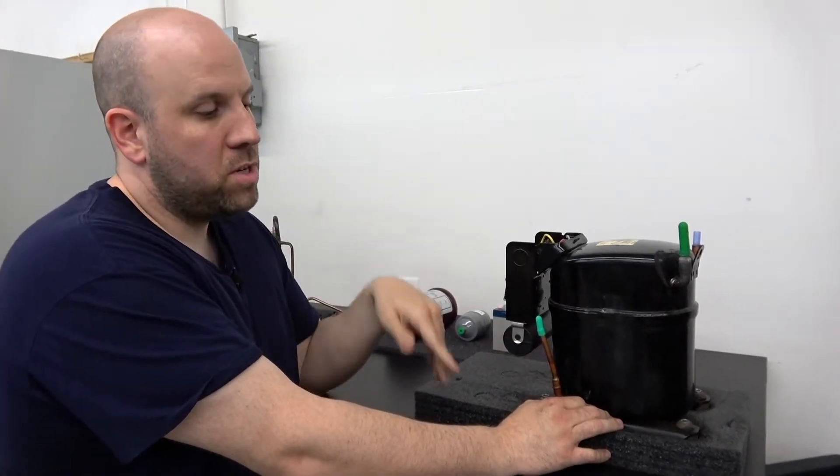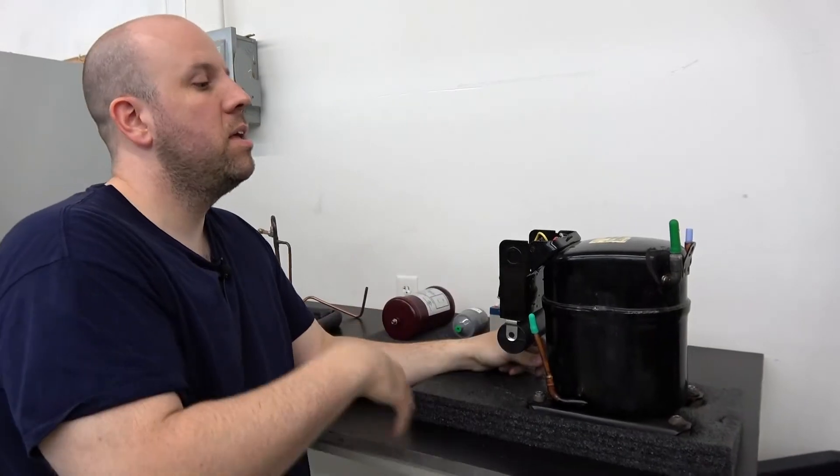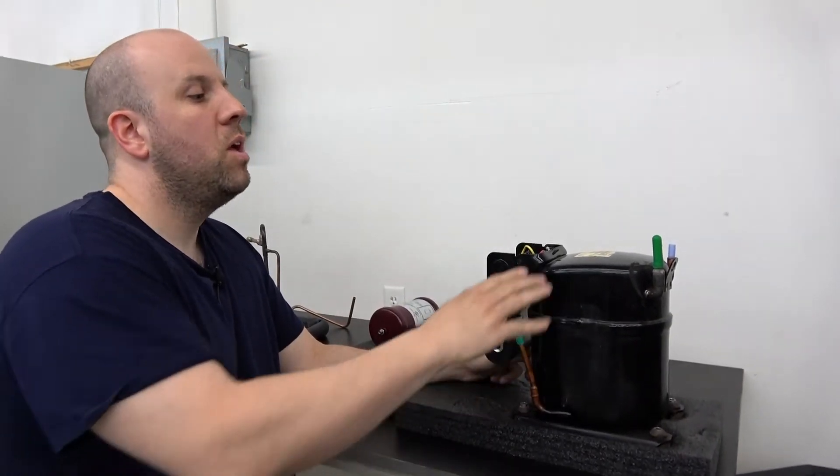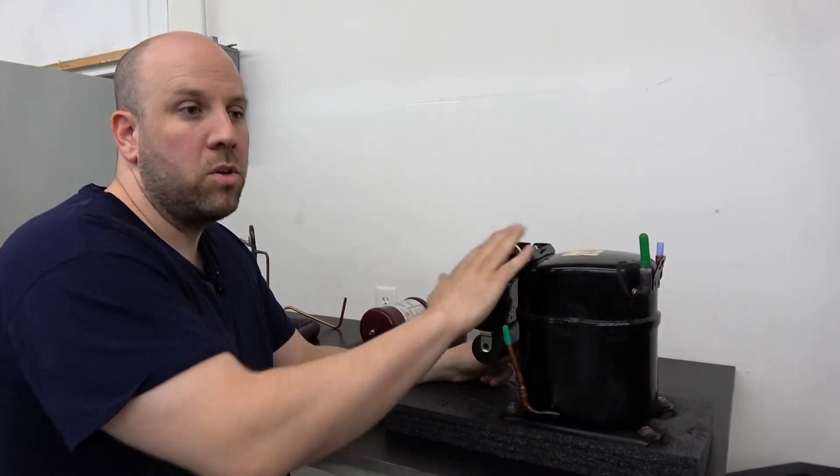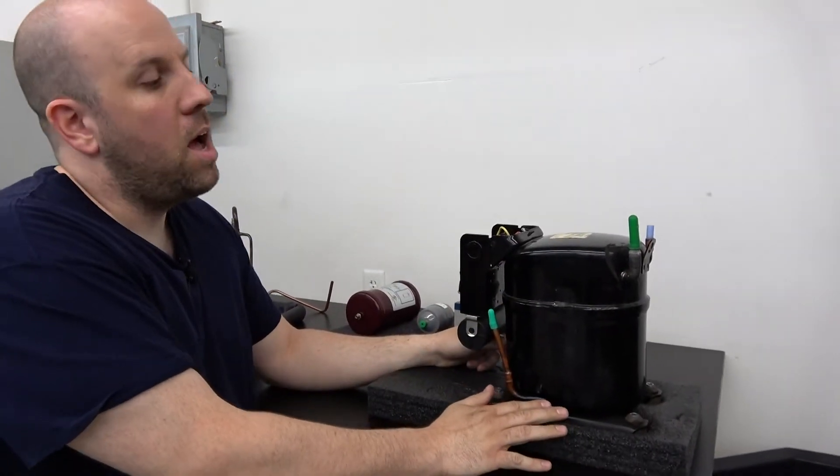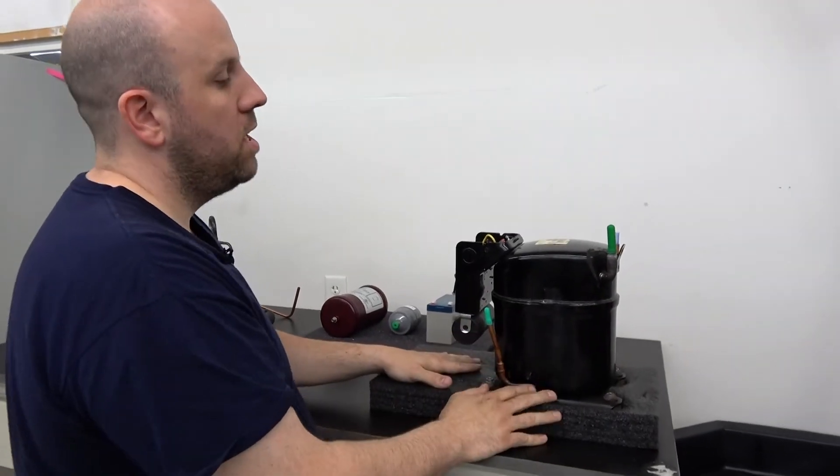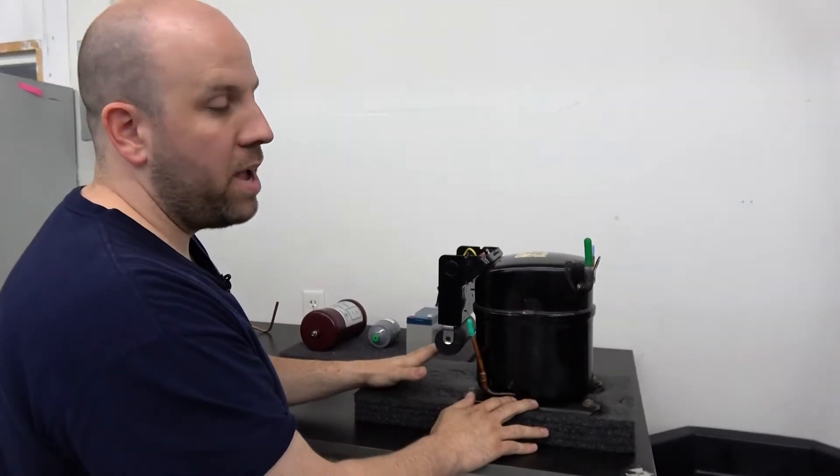So we run them, get them hot, dump them out and put new oil in. We run them, keep running them, dump it, keep running them, dump it until the oil coming out of here looks like new oil. At that point it's flushed. We consider that flushed out, fill it up, and it's ready to get put back in.